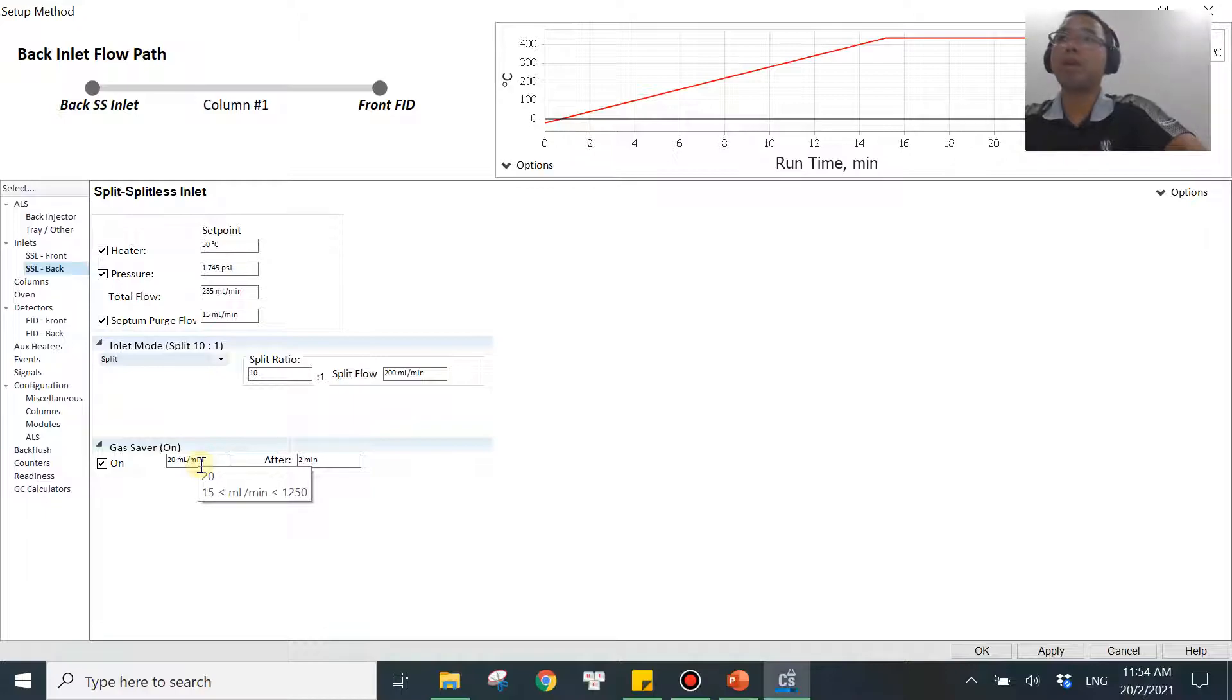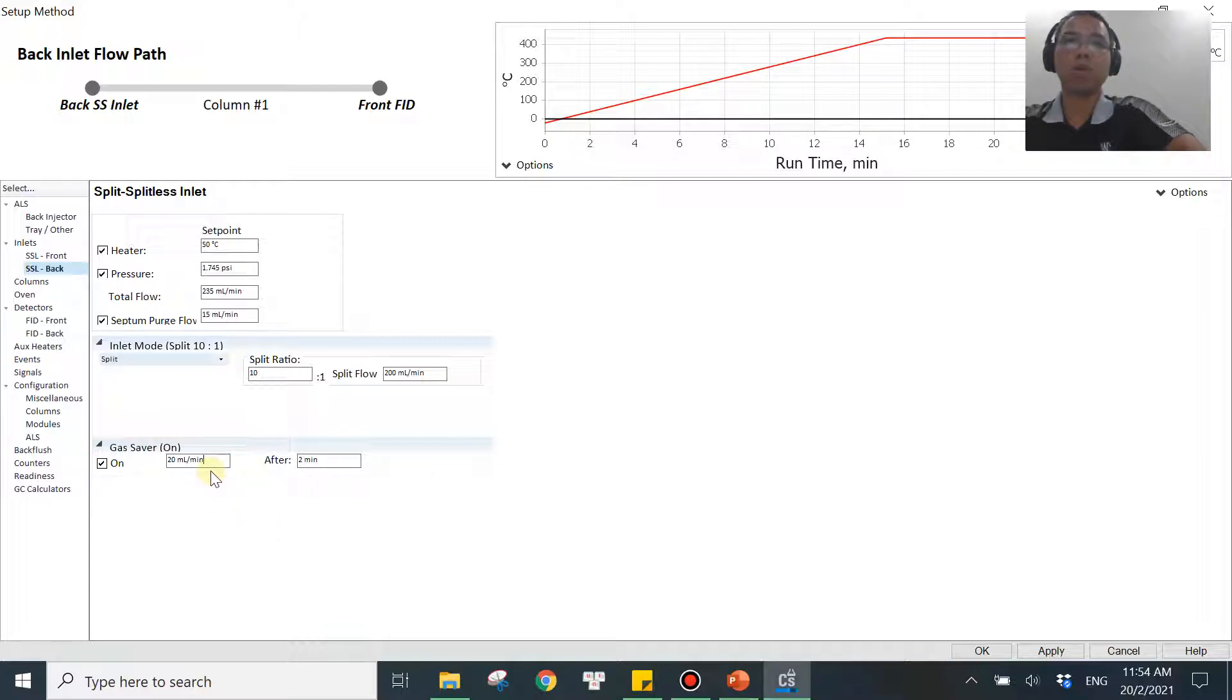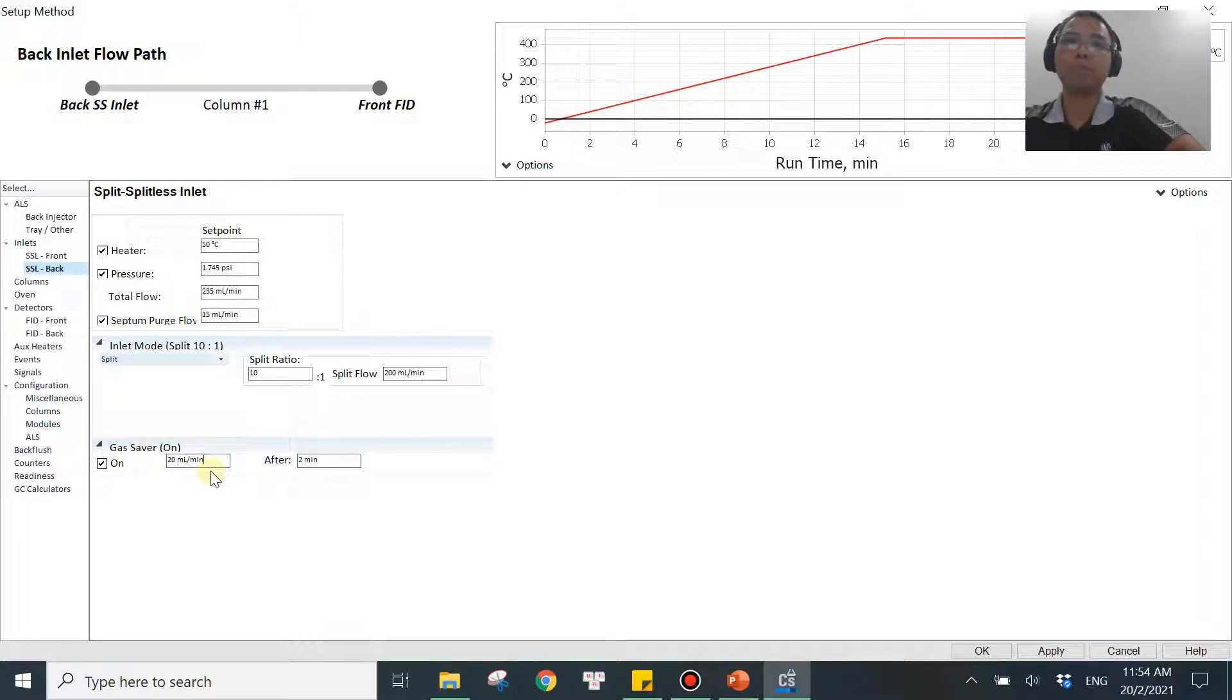But what about the upper limit? The upper limit is probably, most of the time—I would say 99% of the time—20 mL per minute should be working well for you, or even 15 mL per minute should be working well for you. But one scenario I want you to keep in mind when it comes to the upper limit is, actually I've seen this before, so that's why I want to share with you guys about this one.